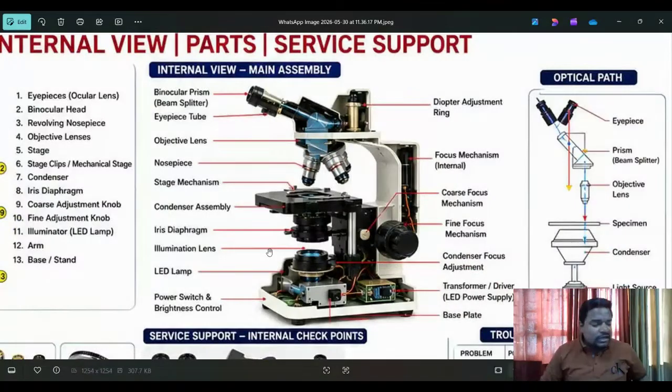This is the main part I'm going to show you, which is important for practical service support purposes. Sir, I am a biomedical engineer, I need service support, sir. I still don't know what you explain. This is information, sir, but I need to perform my duty first, because I have many issues in my hospital. Do you think like that? Yes or no? Yes. So my focus is live sessions for everyone, and I'm going to reveal it.